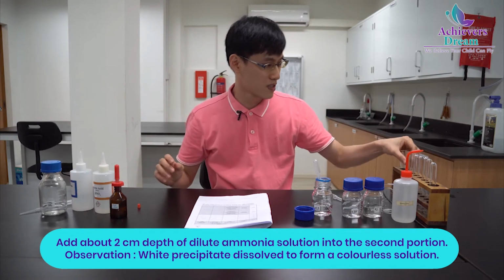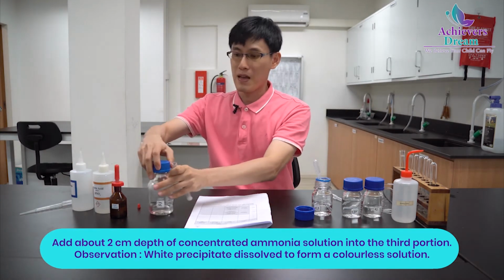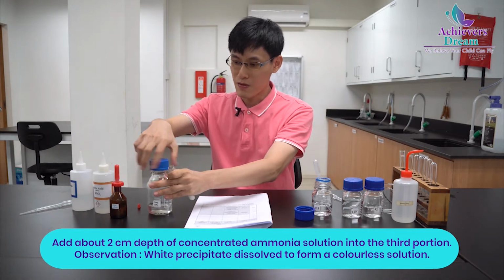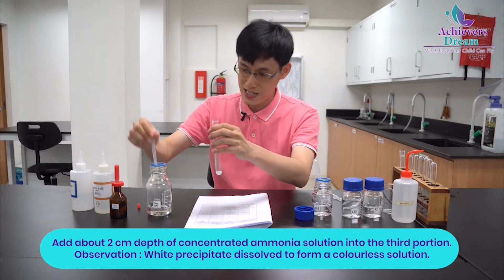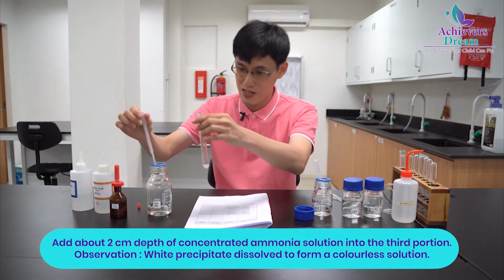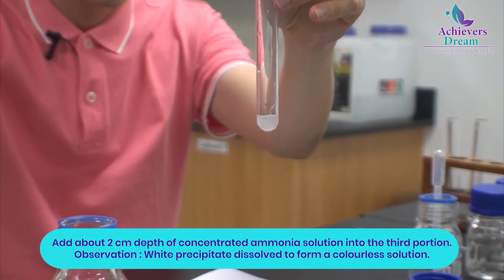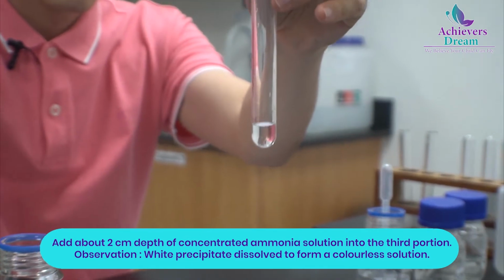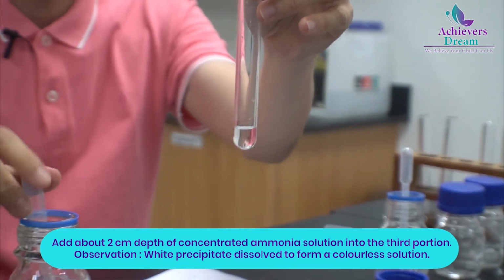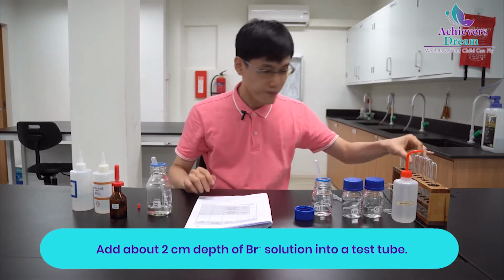Okay. Now for concentrated ammonia. Gotta be careful here because the smell is quite strong. Ammonia. Okay, just a bit will do. Let's see if the precipitate dissolves. Wow, it's even faster now. Look. Even faster than the dilute ammonia one. So this is for chloride.